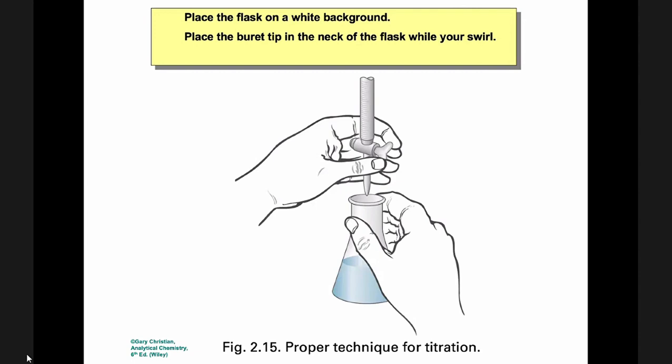And then how do you titrate properly? So during your lab activity, you should also be observant of how the analyst actually does the titration, for you to get familiar with the techniques. And you will also have virtual laboratories in this, especially when you get into acid-base titration.